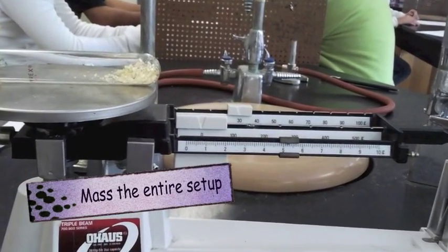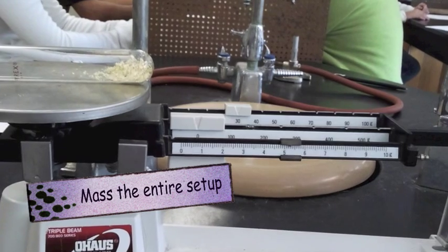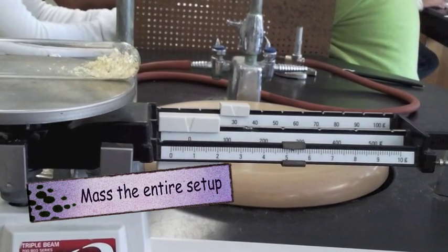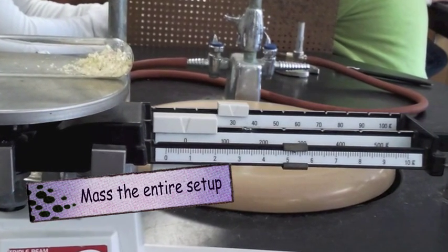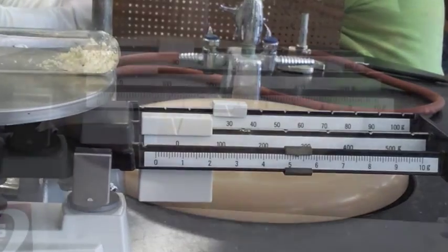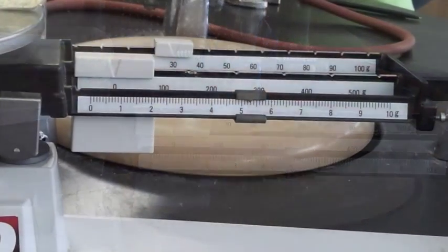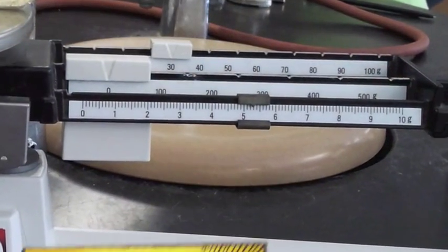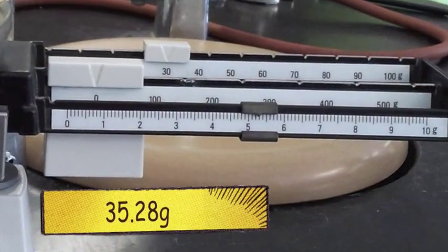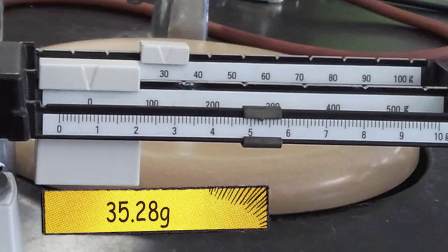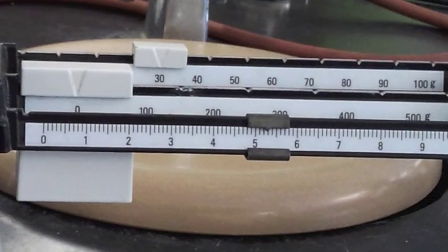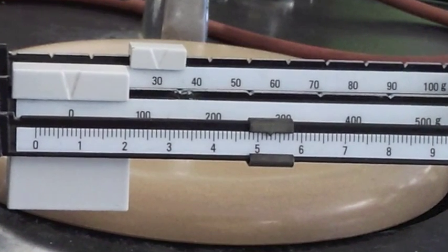So we're going to take the test tube with the copper and sulfur and the rubber dam on top of it. We're going to mass the entire setup. As you can see, we have 35.28 grams. We're going to record that.